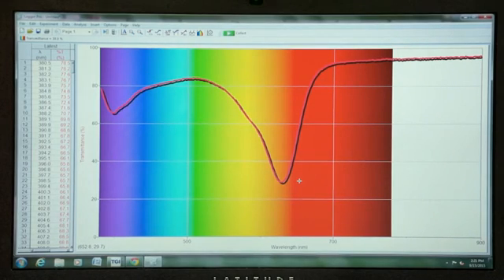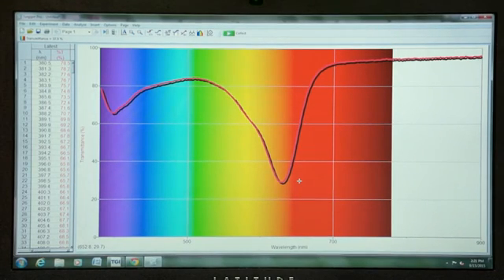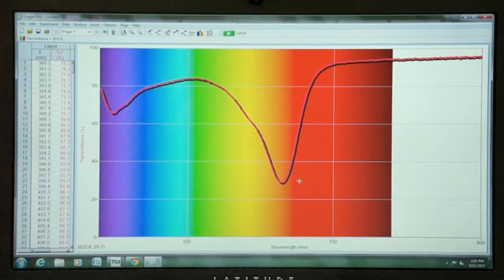now the full backdrop, the full color display appears on the graph. Notice one other important thing.